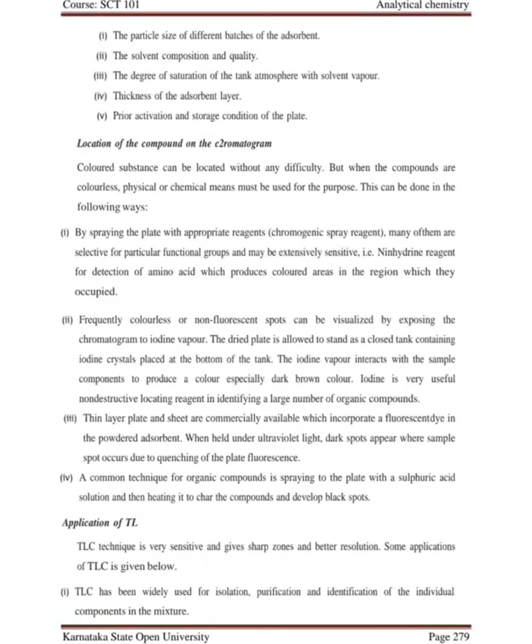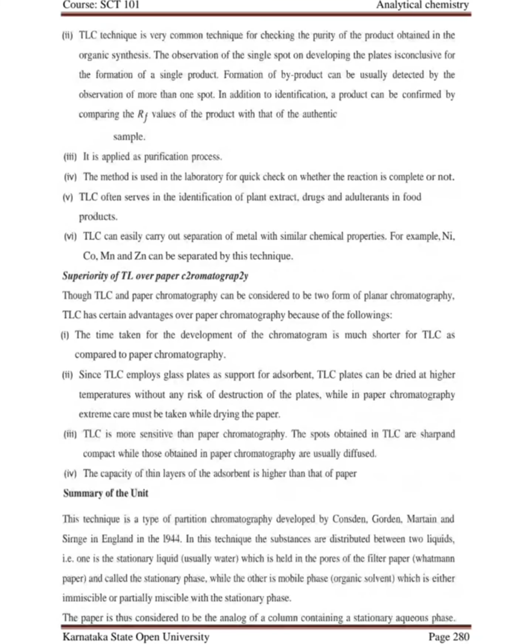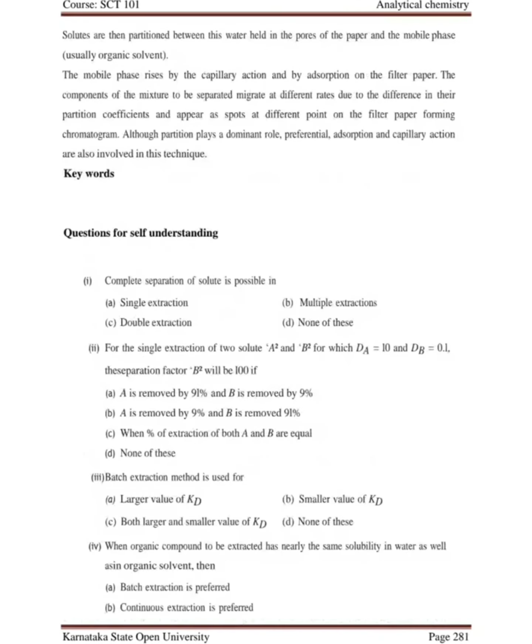Further, it can be used for the isolation, purification, and identification of compounds, phytoconstituents. It is also used for checking the purity of compounds, or organic synthesized compounds.